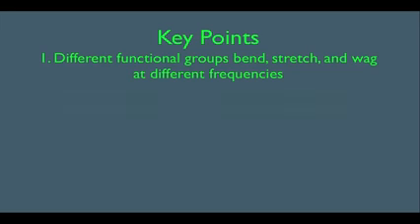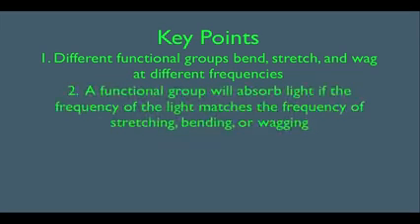frequencies. We're also going to learn that a functional group will absorb light if the frequency of light matches the frequency of stretching, bending, or wagging. This is going to be our most important key point. This is the basics of how the IR machine functions.